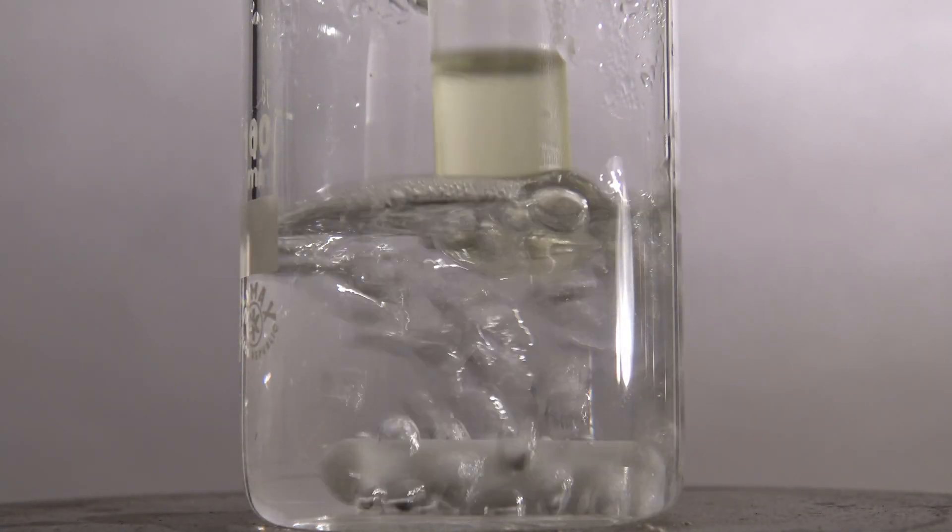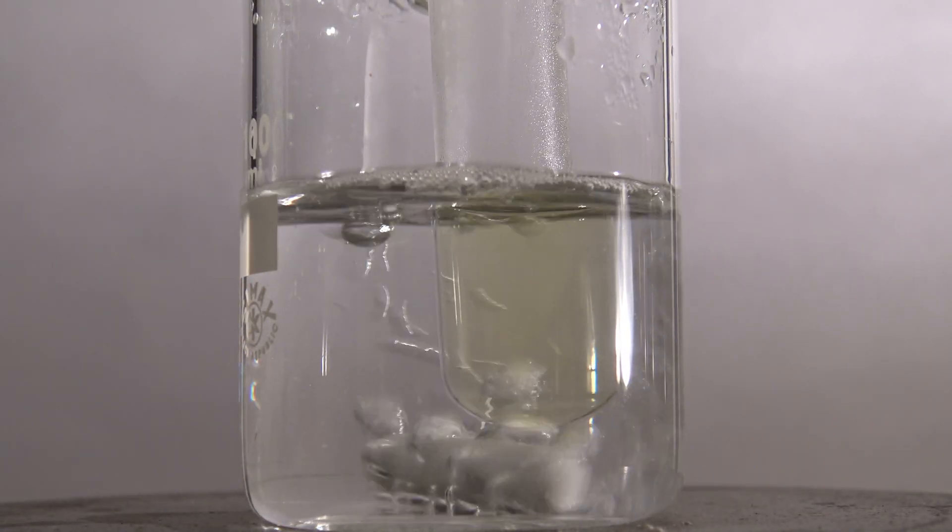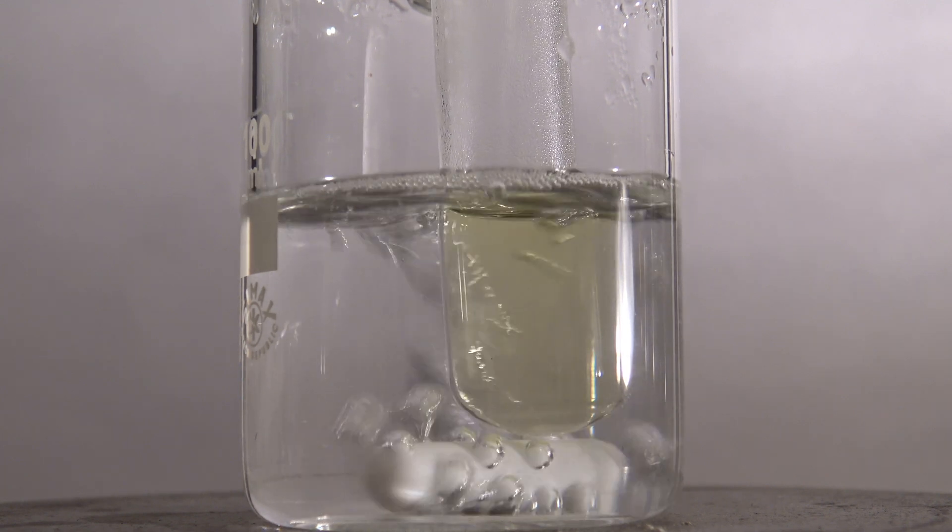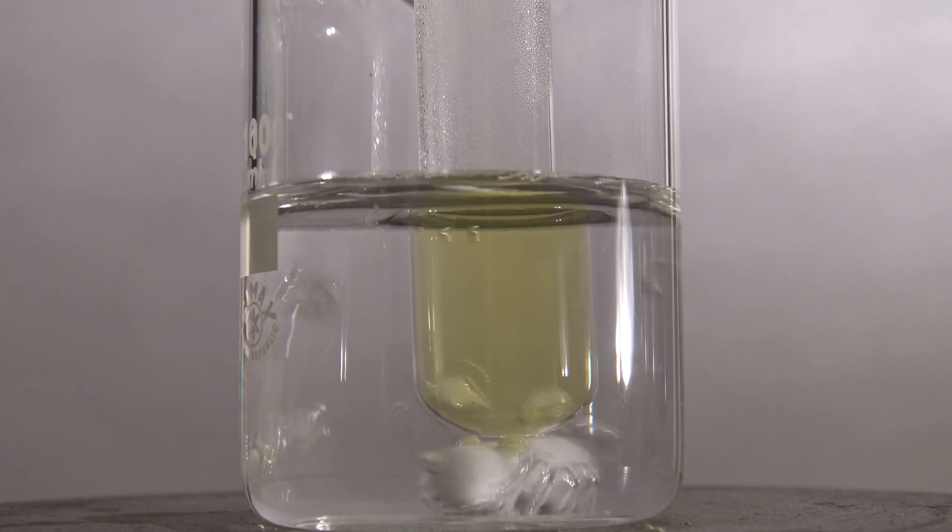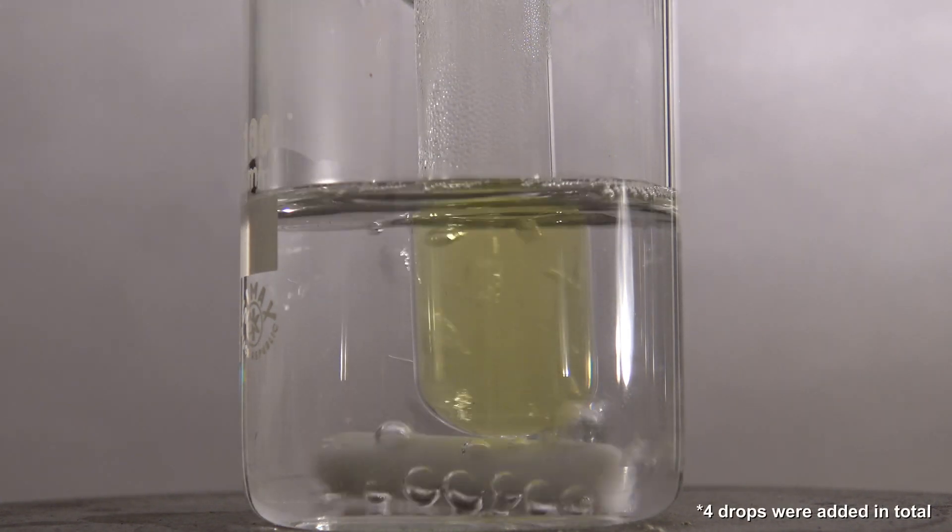By heating, the speed of the formation of precipitate can also be increased. The solution turned only a bit cloudy, so three drops of diluted ammonia were added while heating.